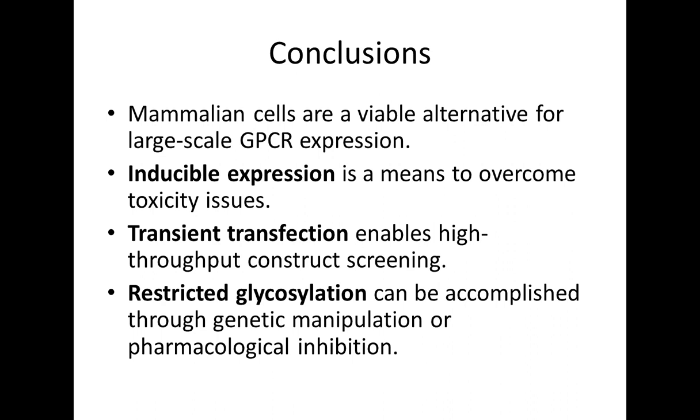Let's get started. Our first question is, are there strategies to help expression using chaperones, etc.? Sure. Basically there are strategies to stabilize the receptor from both ends, we could say. One thing that often improves expression is to express in the presence of an antagonist, a ligand.